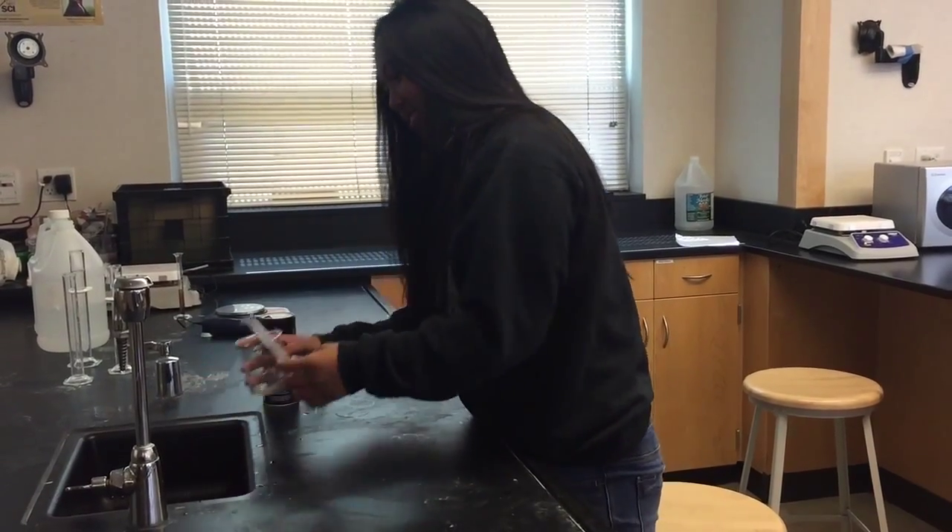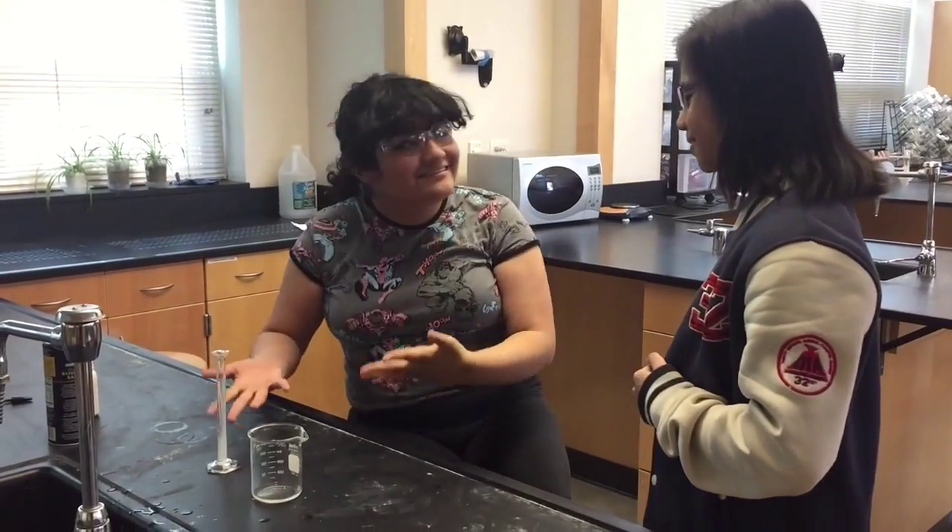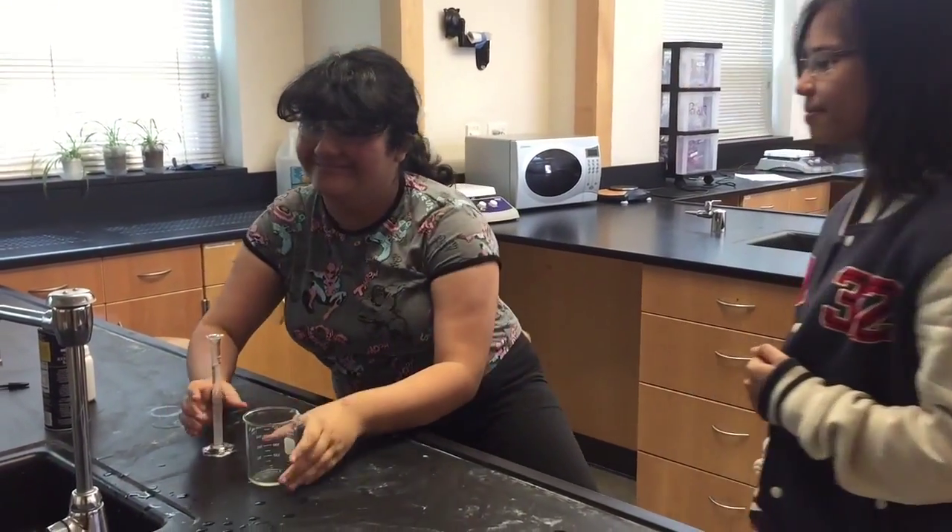Dispose of liquid and solid waste in the appropriate waste containers. Never pour chemicals down the sink unless instructed to do so. Always ask if unsure.